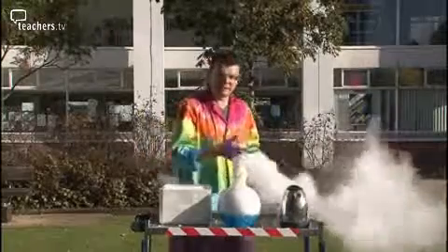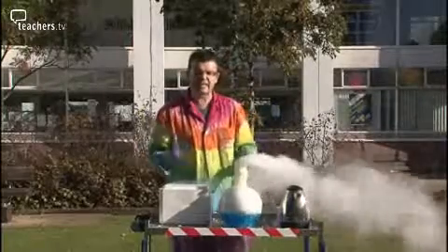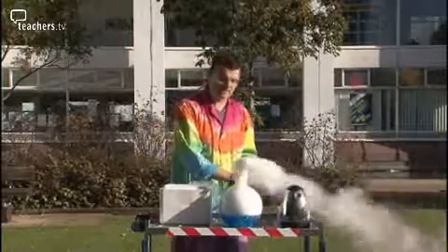Thirdly, as you can probably see, the water vapour is going down. This is proving that CO2 is denser than air because it's dragging the water vapour down with it.